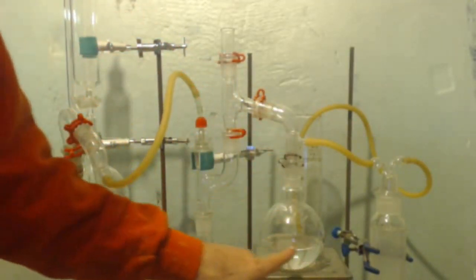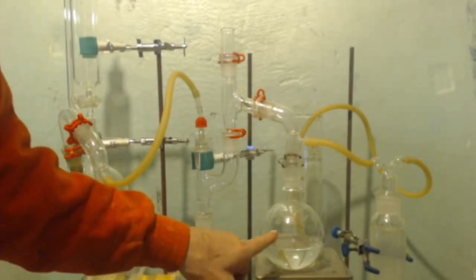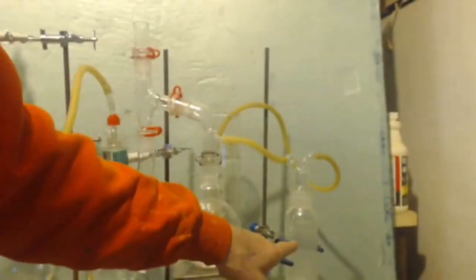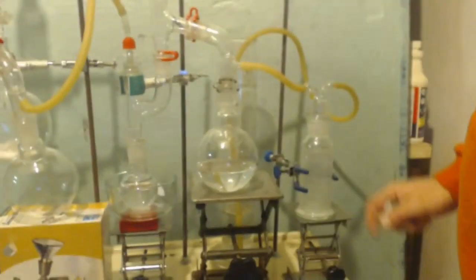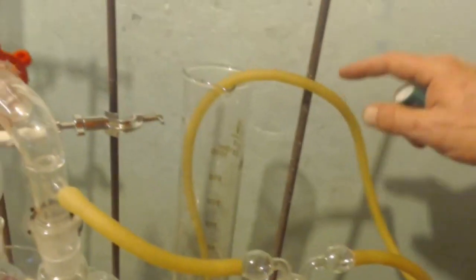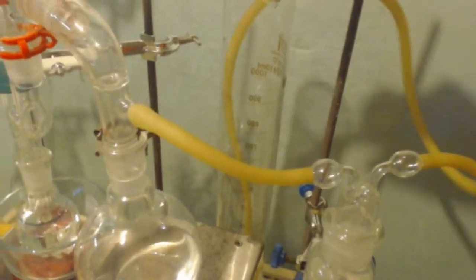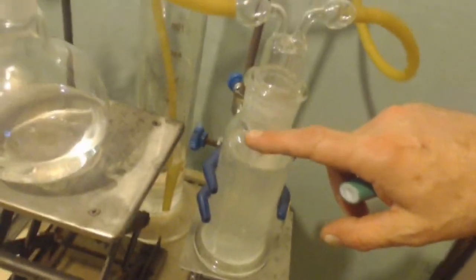Now, I did put a little bit of water in here, even though this should be empty, because this is a bigger bottle than this, because this leads into here now. It's going to bubble through here. This has sodium hydroxide in it, right? And it'll bubble through here. Now you can see it comes out here, around here to this 1,000 milliliter graduated cylinder. I only put 250 milliliters in it because that's how big this is.